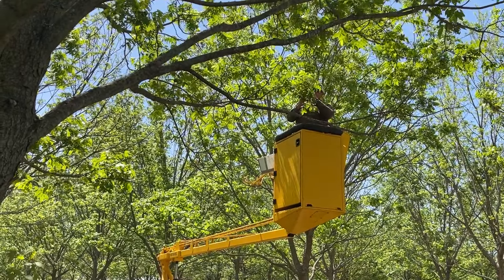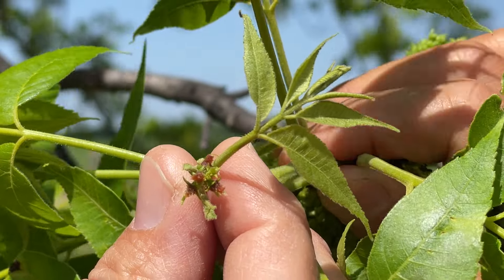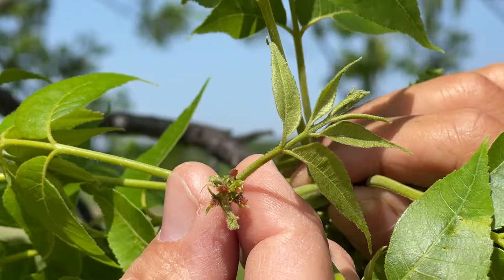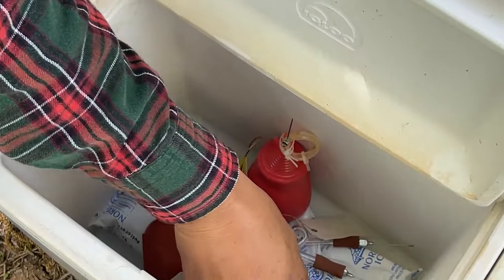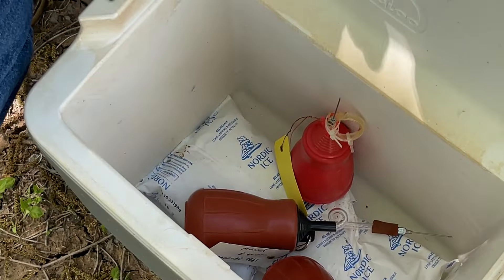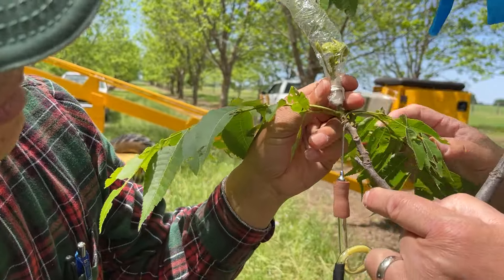One of the ways we test receptivity is to take some old pollen, puff it onto the stigma of the female flowers, then blow on it. If they all blow away, you know it's not receptive — it's not sticky. You have to track it carefully because after it becomes receptive it starts to dry down and won't stick afterwards either, so you've got to know that window. These flowers look like they may be past receptivity. So now with four pollen sources, I'll make each cross as 50. Did you see the needle? Push it from here, then puff.